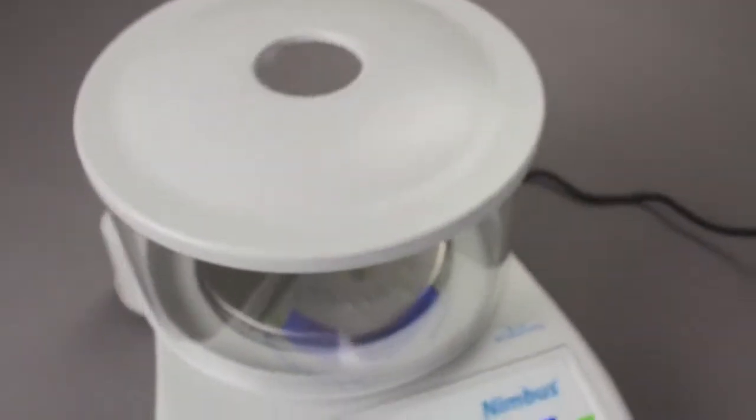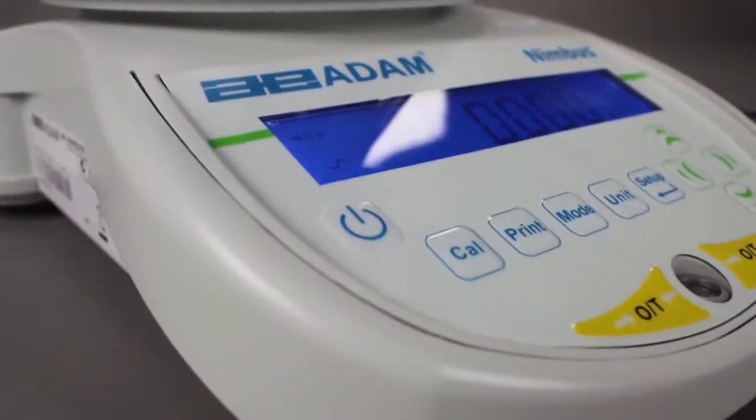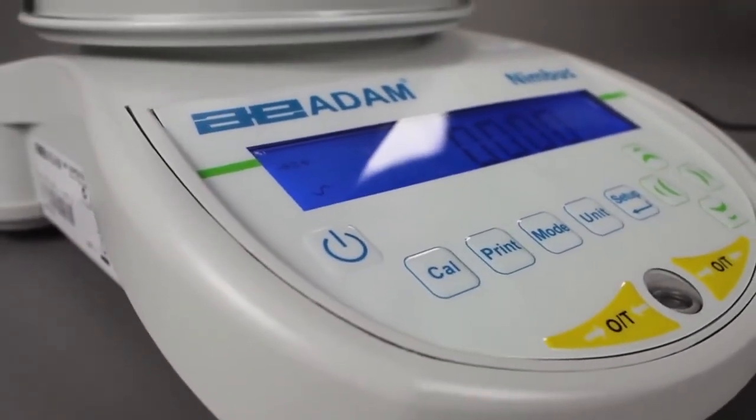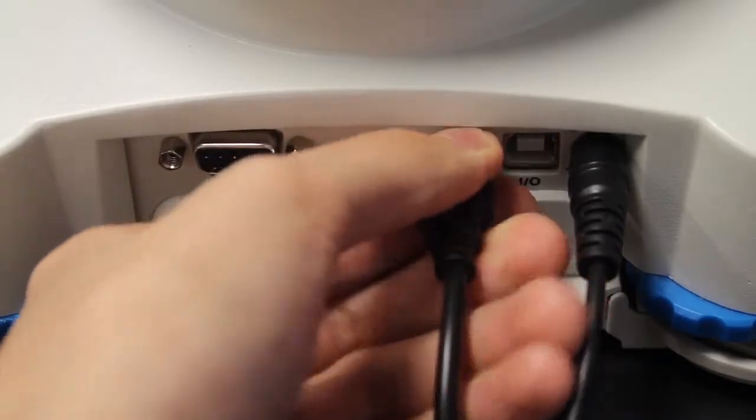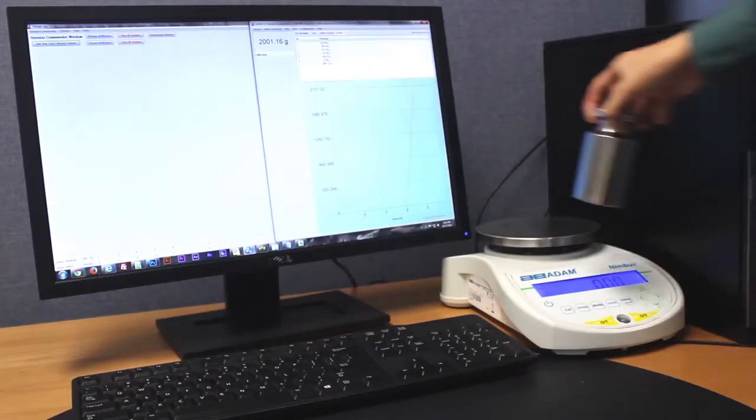The solid metal housing provides a stable base for outstanding precision weighing in labs or variable field environments. The Nimbus features both USB and RS-232 interfaces for connecting to computers and printers.